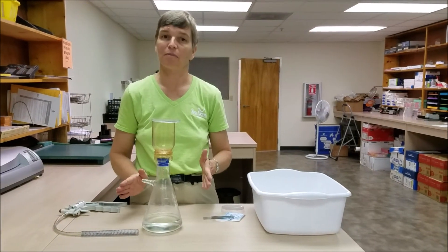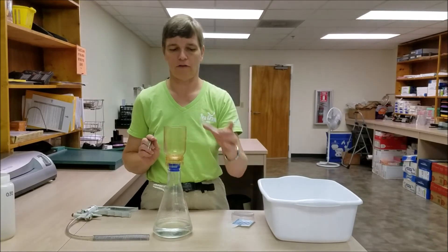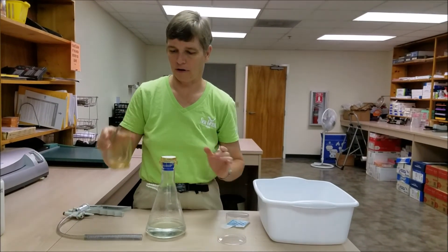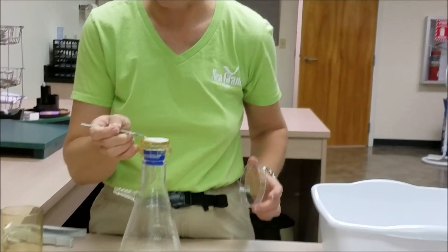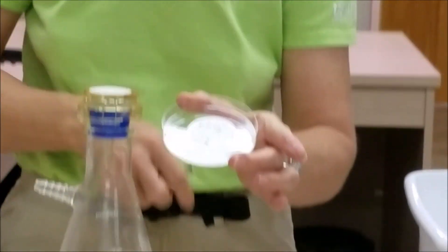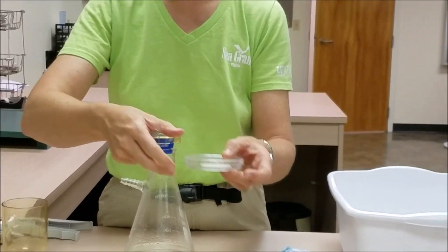Once you've completely filtered your sample, you need to take the filter paper and place it in a petri dish. Carefully, using tongs, grab the filter paper by the edge, lift it into the base of a petri dish, and cover the petri dish with the lid.